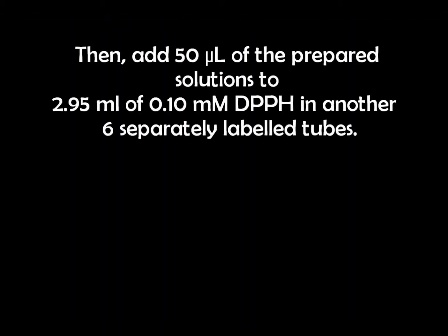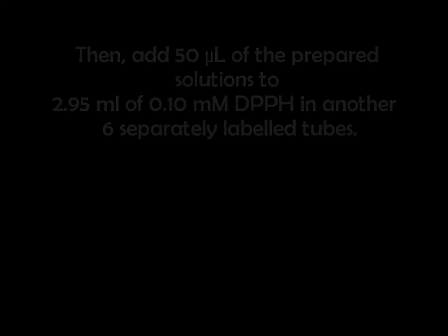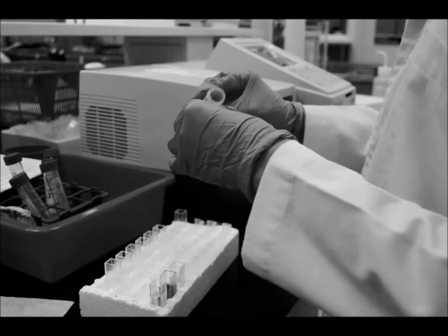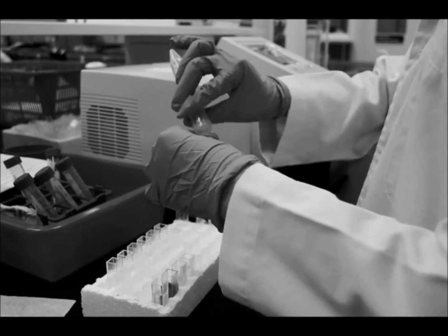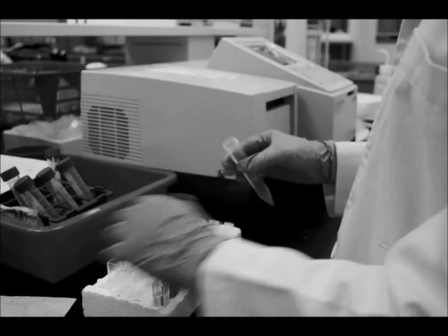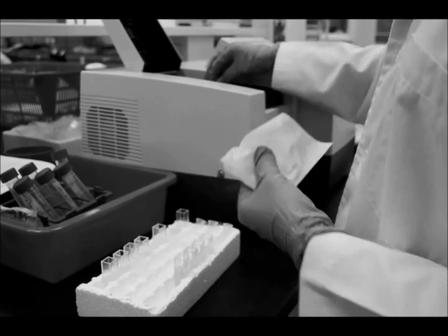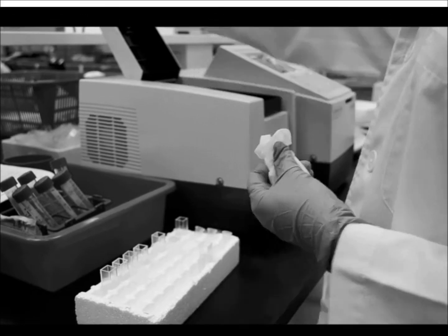Then add 50 microliters of the prepared solutions to 2.95 ml of 0.1 millimolar DPPH in another 6 separately labeled tubes. Incubate all 6 tubes in the dark for 30 minutes and read their absorbances at 517 nanometers. And that's the end of the practical.